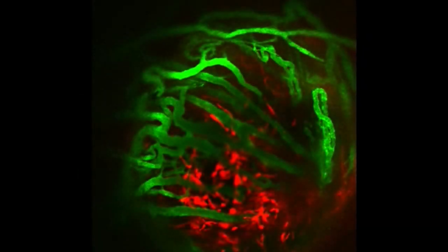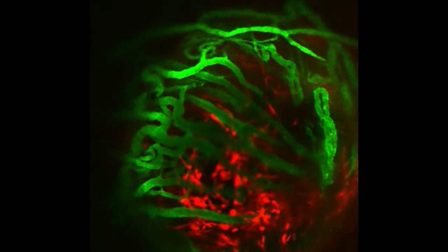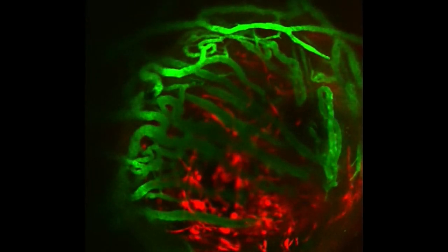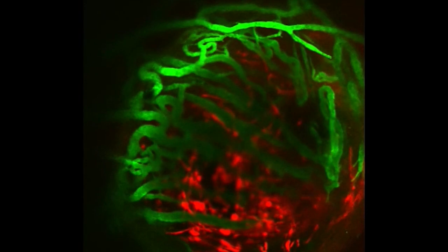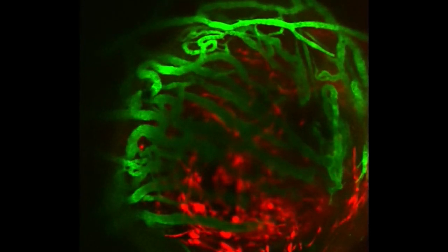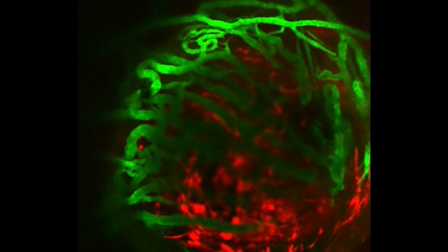Or in tumours. These are few examples of what can be accomplished with intravital subcellular microscopy. This approach is opening the door to investigate cell biology under both physiological and pathological conditions in multicellular organisms. This is a dream coming true.